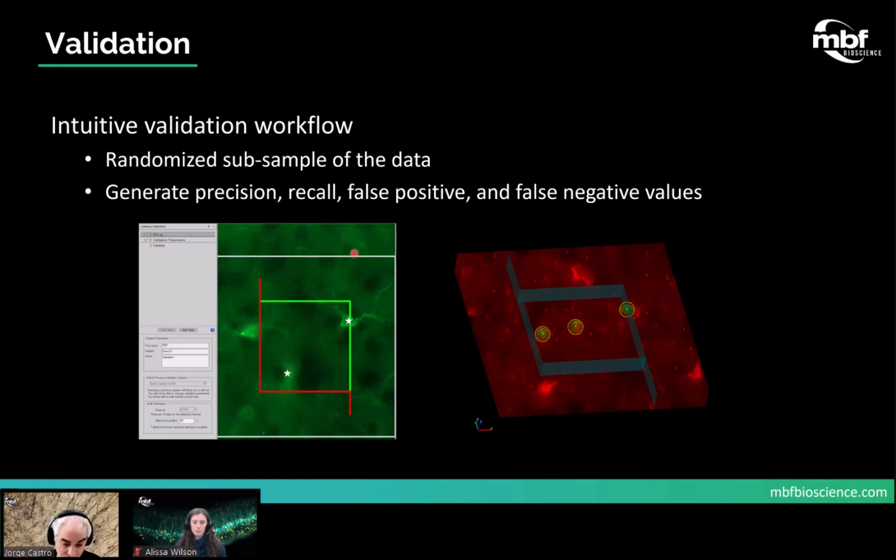Finally, once the run or count is done, the software will provide the same kind of report you would receive in the Stereo Investigator, with your cell number estimation, different types of coefficient of error, etc. Obviously, during the first runs, to make sure the software is counting the right cells, you want to validate the results. And this is also something that we added as a workflow here.